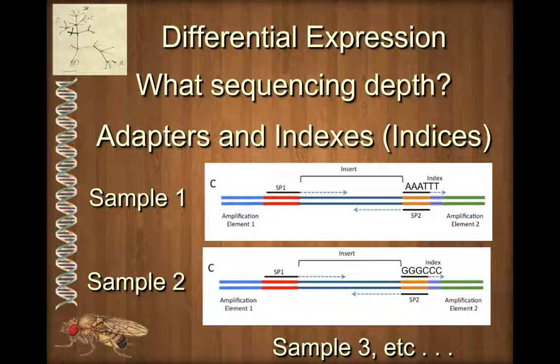So if our reads were 100 base pairs in length, we would do however many 100 base pair reads until we got to a total of about 150 billion base pairs. And again, the reason for that is because of the random sampling. As we add more and more reads to our sample size, they're going to be somewhat redundant, which to some extent is what we want, right? We want them to be a little bit redundant so that we can find their overlaps, line them up, and then assemble the entire genome. But the more reads we get, the more we are just resampling things that we've already got before.